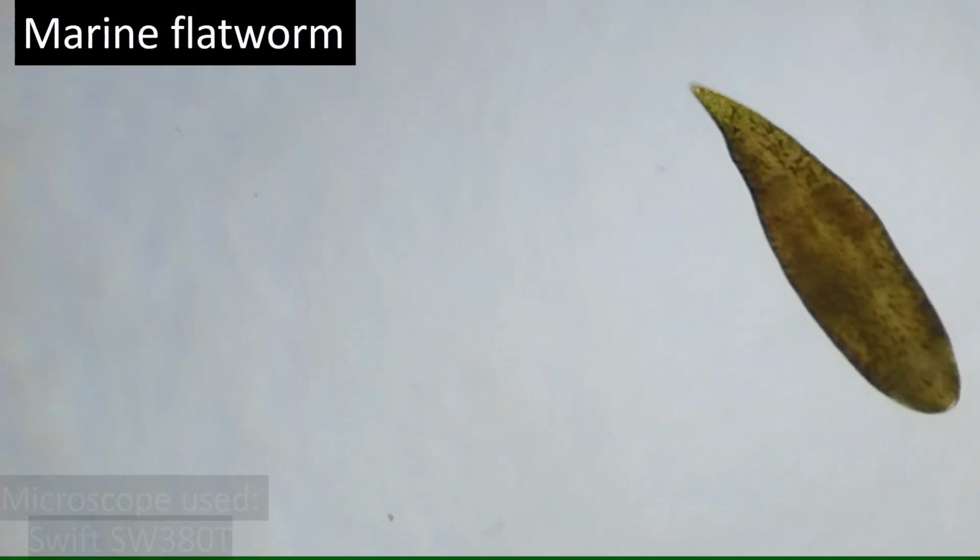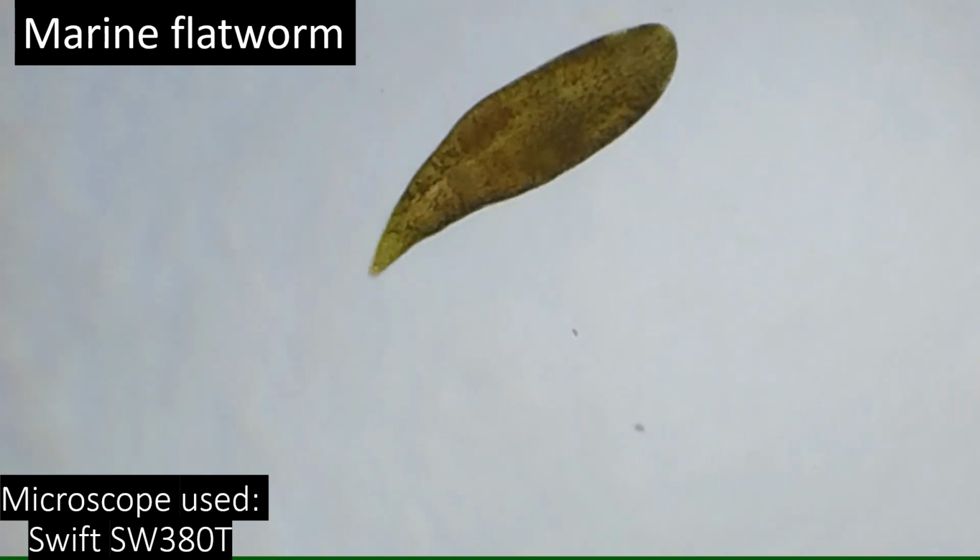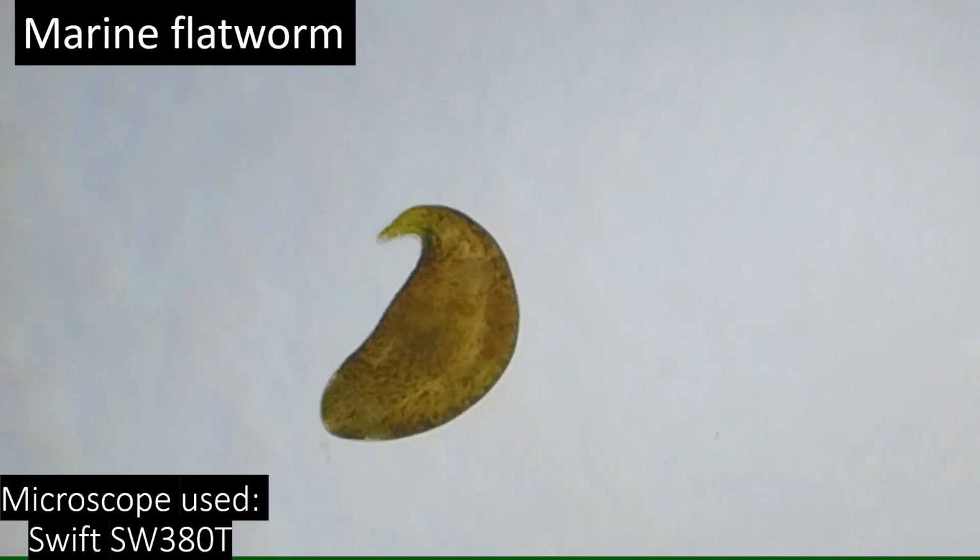This is a marine flatworm. Aquatic flatworms live in both saltwater and freshwater habitats. However, there are also flatworms which live in moist areas on land.